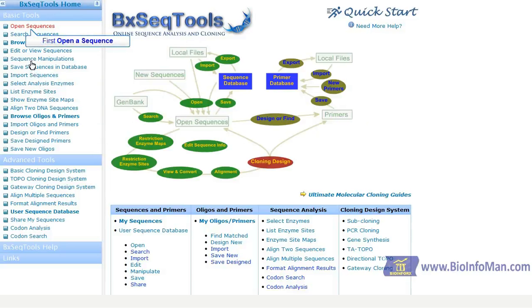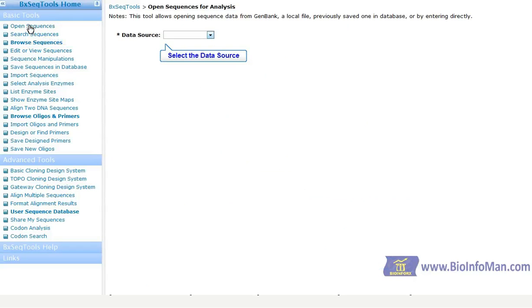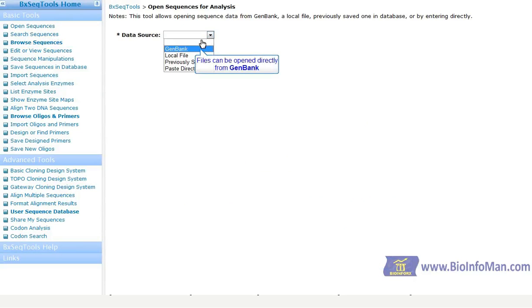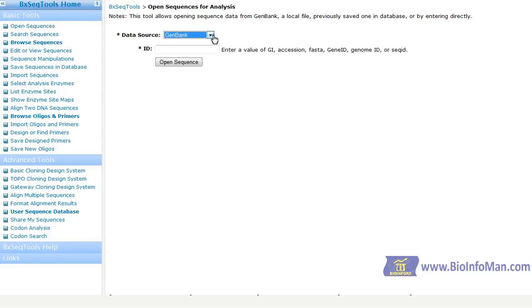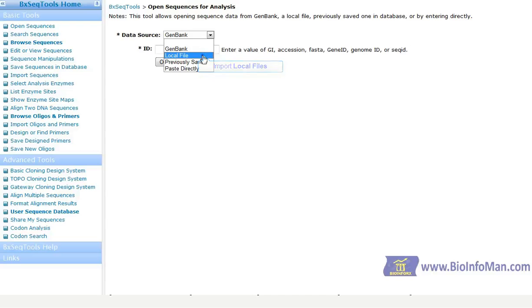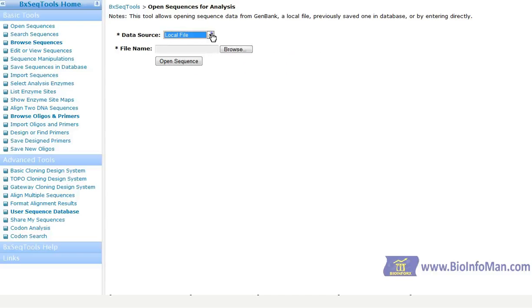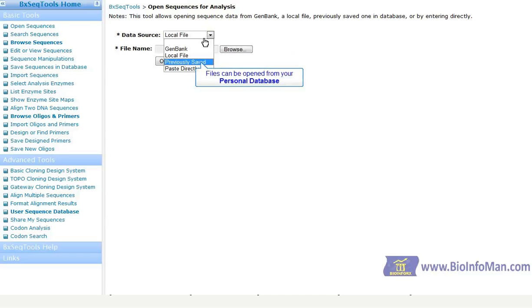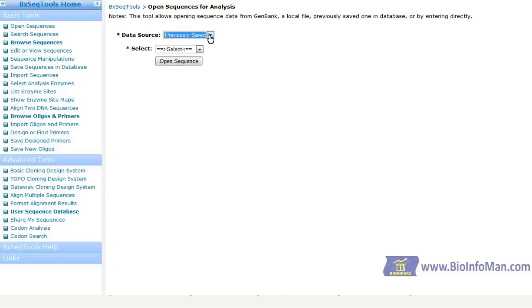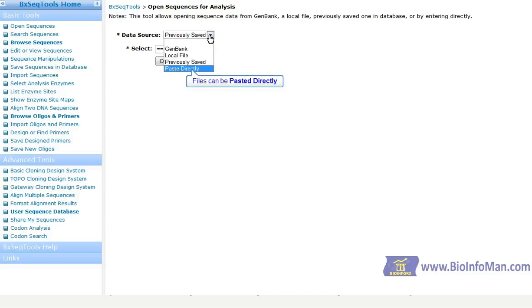To get started, open a sequence. Then select the data source. Files can be opened directly from GenBank, imported from a local file, opened from your personal database, or pasted directly.